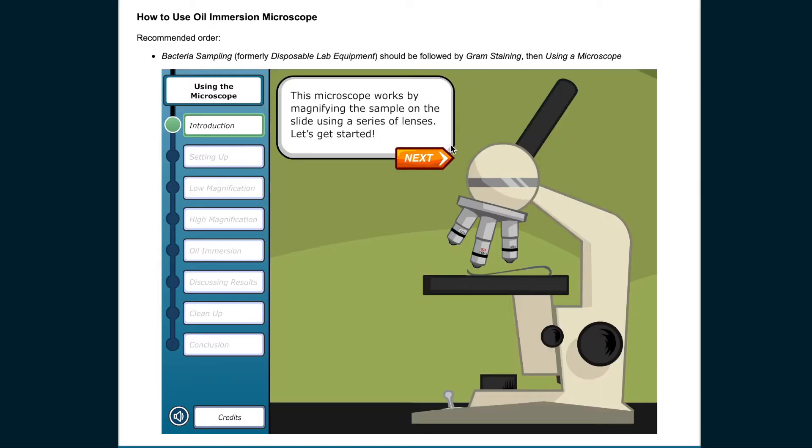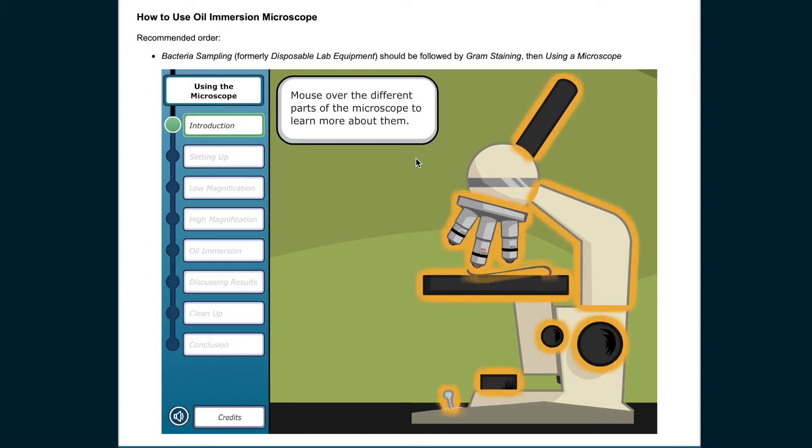This microscope works by magnifying the sample on the slide using a series of lenses. Let's get started.